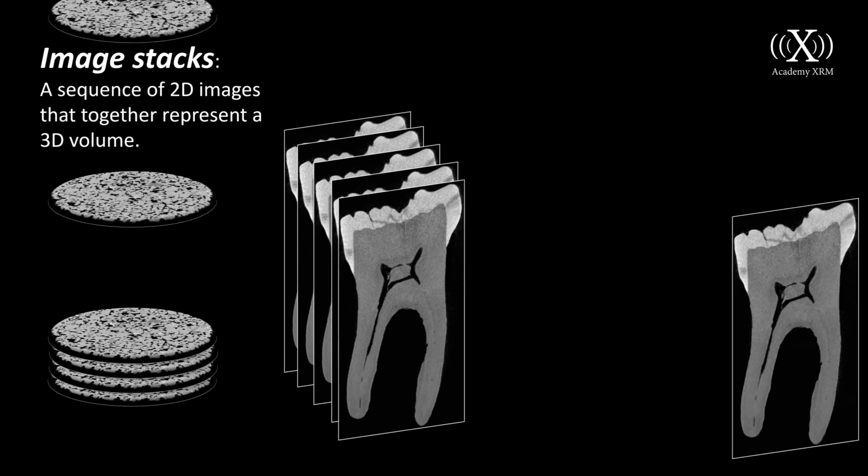And click Apply. Now we see the new scalar dataset is loaded, and when I hover over the slice view, I see only one number per voxel, which confirms the volume is now scalar. Next, we correct the voxel size. I need to go to the Volumes module and select my newly created scalar volume. Under Volume Information, we have the image spacing, which technically represents the voxel size. By default, it is set to 1 millimeter, which is not correct for this dataset.